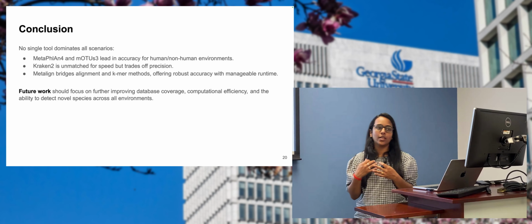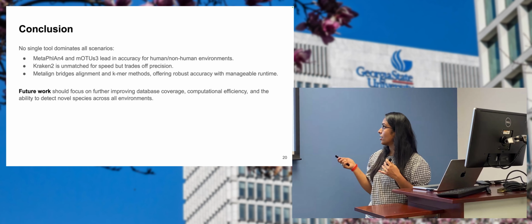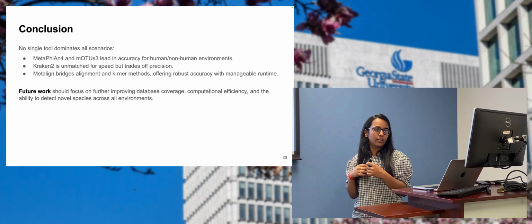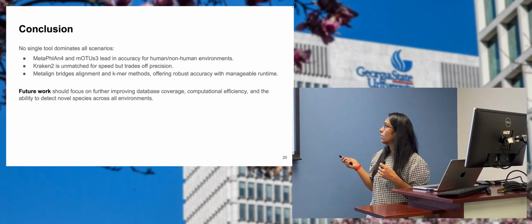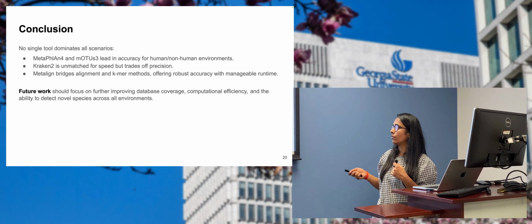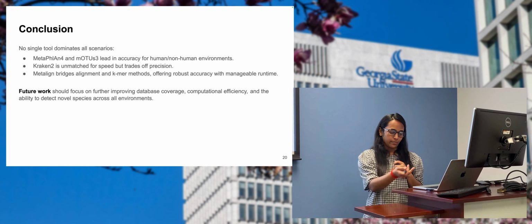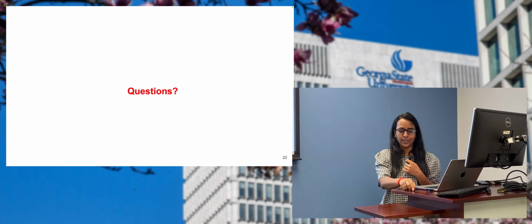Future work: we can improve database coverage and computational efficiency, like replacing some of the methods with machine learning models that will perform well, and improve the ability to detect novel species across all environments, like new species from environmental samples. These are my reference papers. Thank you.